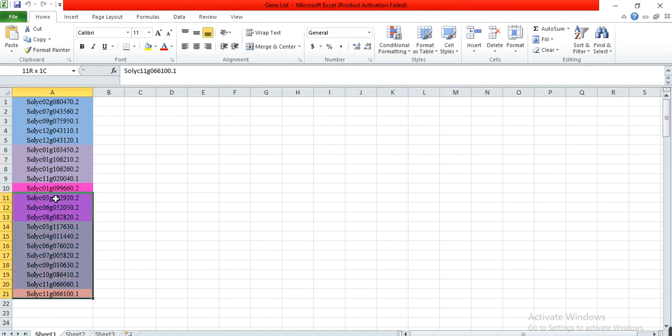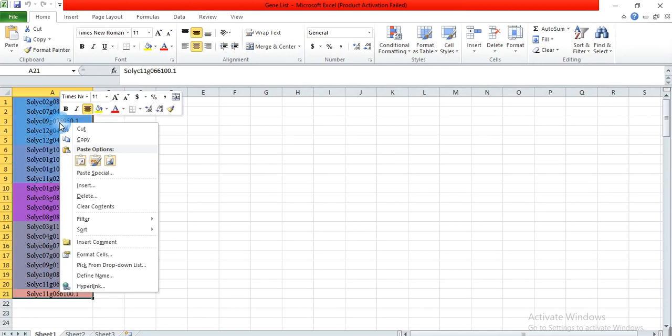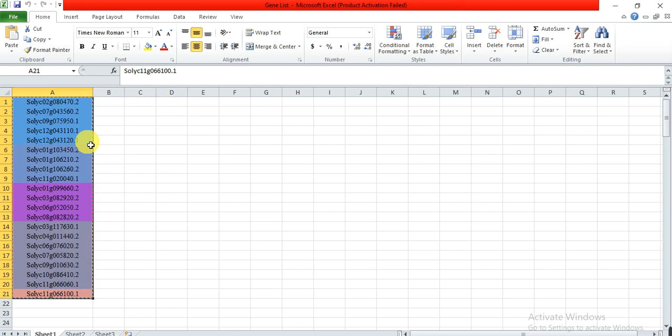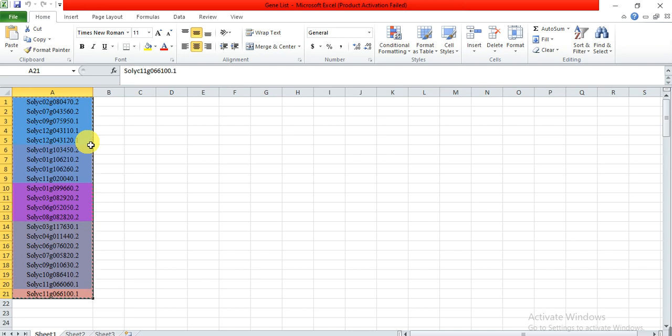First, you need to copy your gene family. I am working on heat shock protein family in Solanum lycopersicum, and this is the list of heat shock protein family genes. I want to check which functional category these genes belong to.